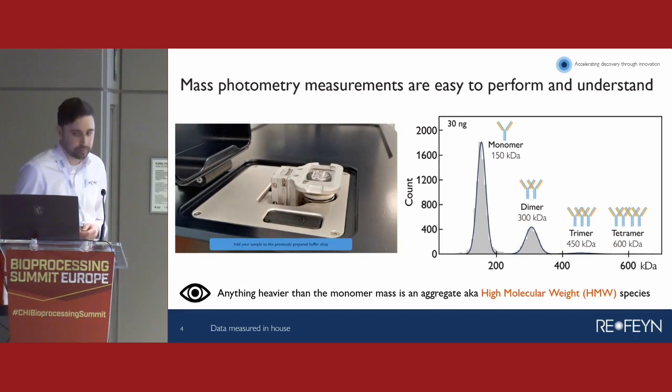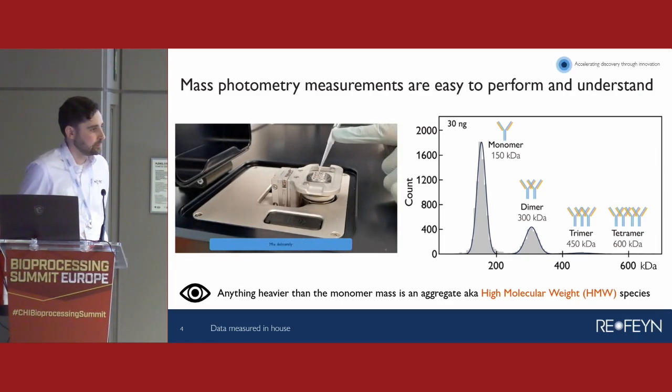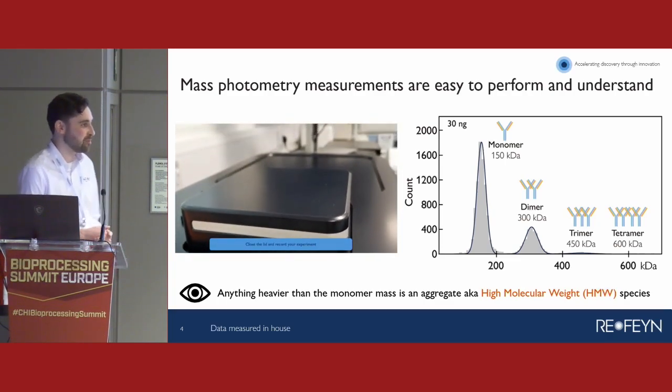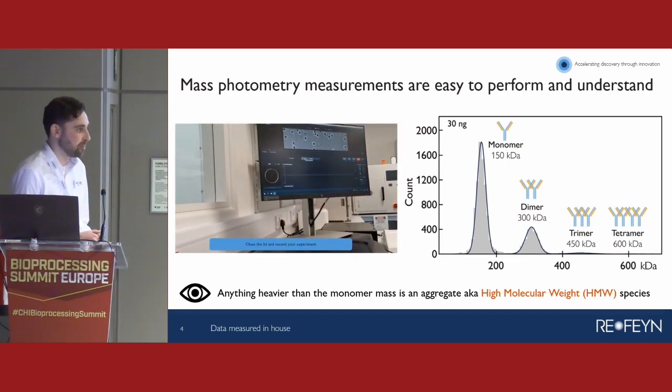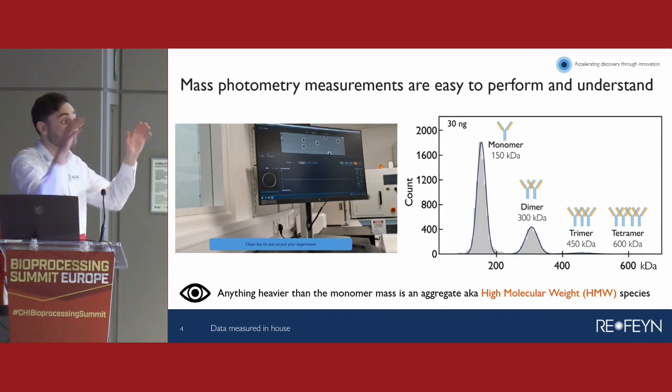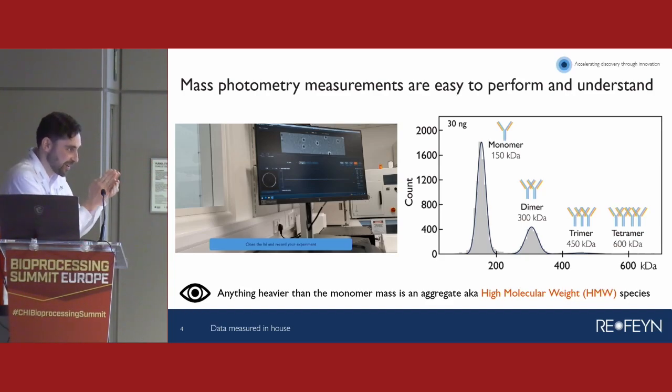I always wonder, what's the benchmark if you look at such a graph? What can you compare it with to know this is the right outcome? So I guess the gold standard, if you want mass measurement, would be native mass spec. We've some really nice papers with people like Albert Heck at Utrecht, where they've done correlative mass photometry with native mass spec, because there are some areas where mass photometry gives you a better overall picture than native mass spec, but obviously for identifying those absolute masses, native mass spec is much better, and we get really nice alignment with the data, and the two can be used nicely together. Okay, thank you.